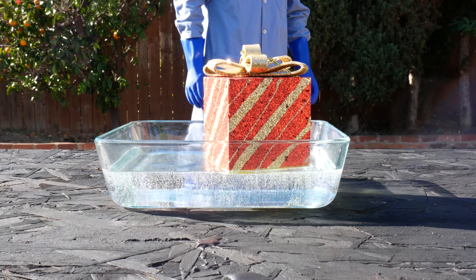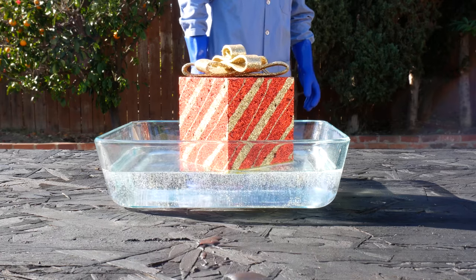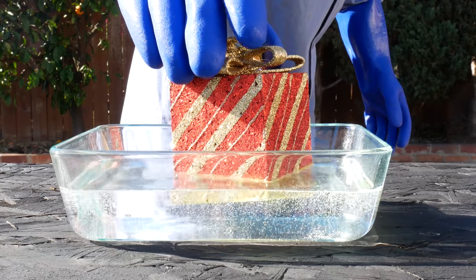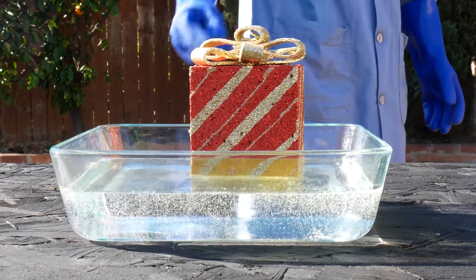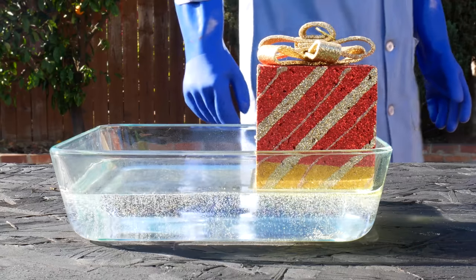It's just floating like a cute little boat! Should we push it down? Oh yeah! It definitely got rid of the color real quick. In order to clean up this mess, I'm going to use a little sponge here.